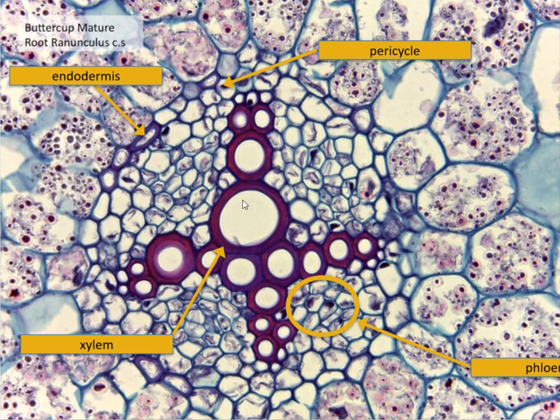And then this time we have the xylem and phloem cells, and they're organized differently, right? Because this is a dicot, so we're not seeing that monkey face. The way that I showed students how to memorize this that I learned as an undergrad is that the xylem are these big circular like window cells, and if you notice, they form a plus sign, or if you rotate it a little bit, it looks like an X. So X for xylem, so that's how I memorize these cells. And then the surrounding cells outside of that X are your phloem cells. It's a little cut off here on the PowerPoint, but you can see most of the spelling.